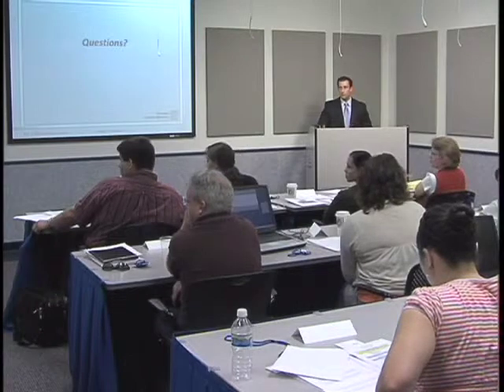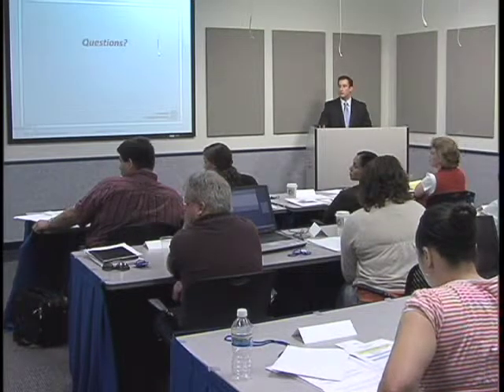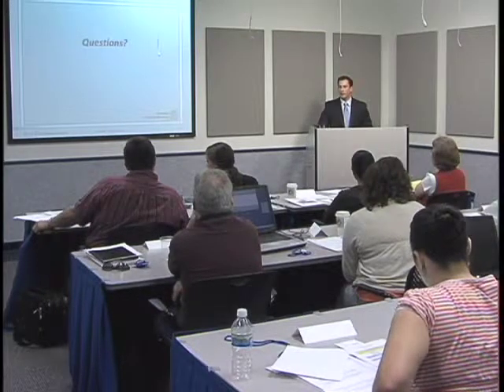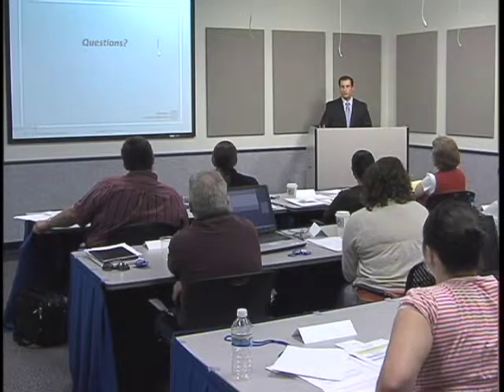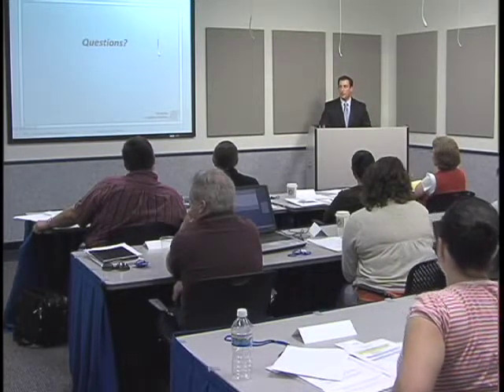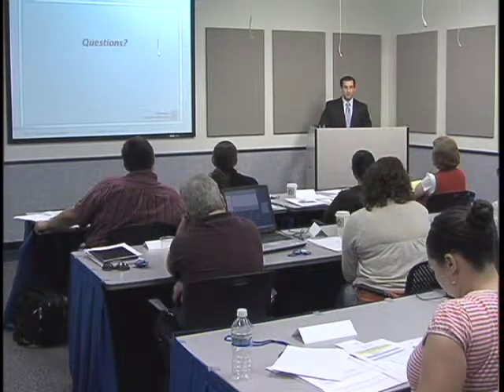Josh, you talked about the validation studies that you did at QIAGEN. Are those on your website, or are the results of those relevant assessments? Those probably aren't, but we do have some that are probably a little more useful for this group. We have some validation testing that was done for a couple of different forensics departments around the U.S. when they got the QIAcube up and running in their labs.